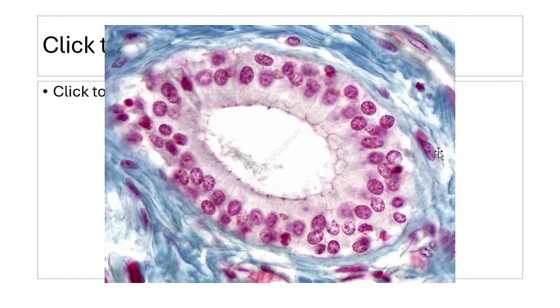The next epithelium is called stratified cuboidal. So this is the duct of one of our glands. The exocrine gland has its excretory duct. So at the bottom of this duct, we can find some cells called basal cells. But the next layer is cuboidal. So it is called stratified cuboidal.